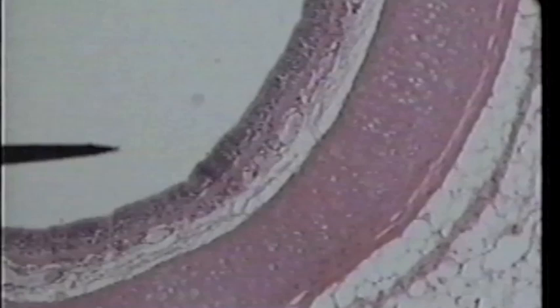We will go up a power and take a look at this connective tissue layer. This is another type of connective tissue — it is considered supportive connective tissue and it's called cartilage. Cartilage also has cells separated by a matrix. The pink that you can see is the matrix.